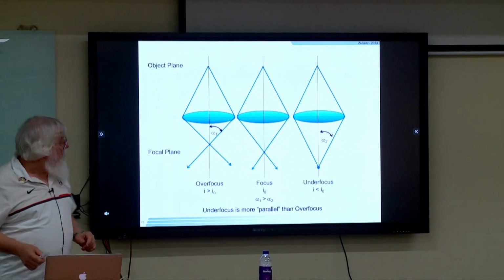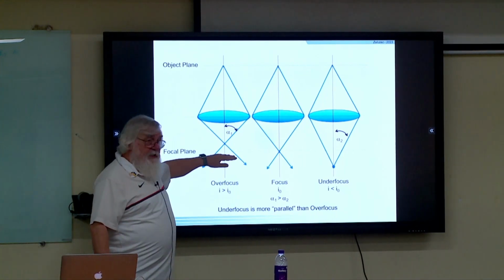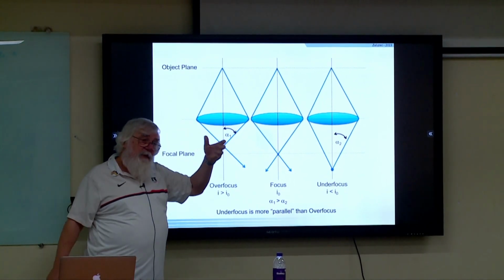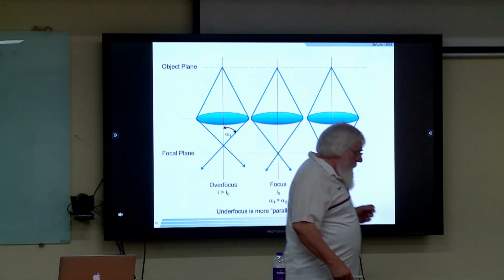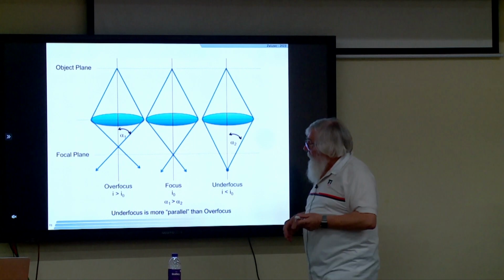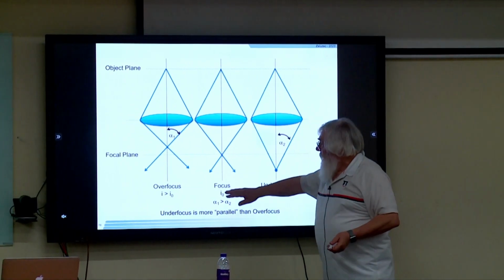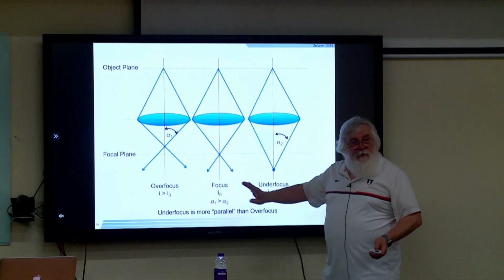Okay. The other thing that the condenser lens does is it controls the size of the probe. And the way you do that is by controlling the strength of the lens. Now, there's one thing to remember about focusing your probe down, and that has to be: are we in an over-focus condition, an in-focus condition, or an under-focus condition? So let's take focus first.